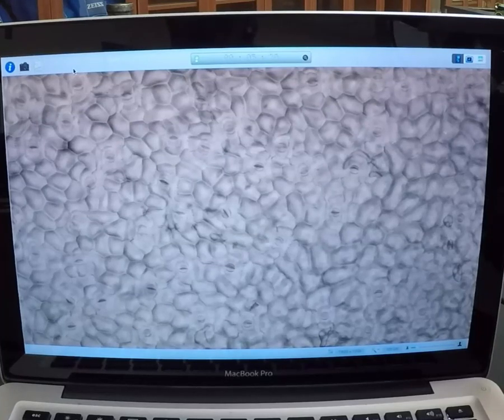Now you're going to need to figure out how many stomata there are for a centimeter squared. This picture here is giving you how many stomata there are for 2 millimeters squared. So you're going to have to do a little bit of math and convert that 2 millimeters squared, multiplying it out to 1 centimeter squared. And you'll have to count the stomata. So what are you counting?